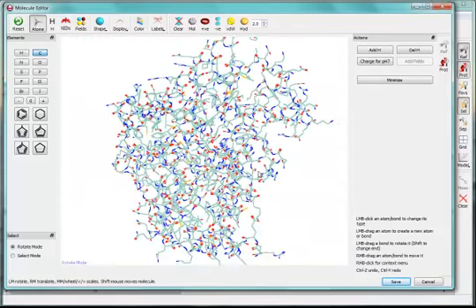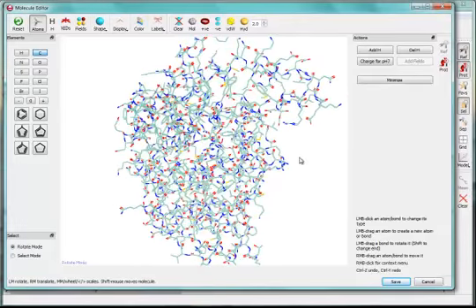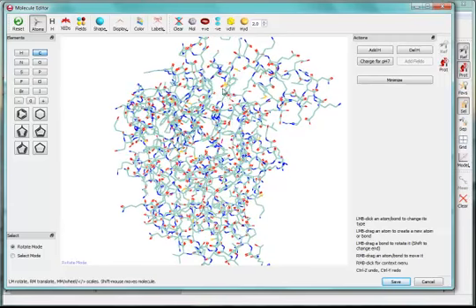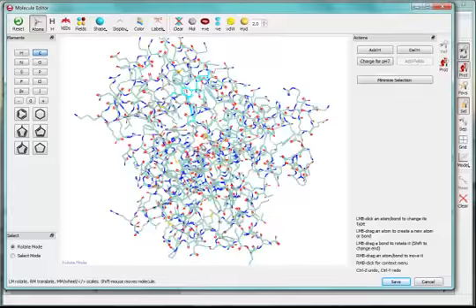If I zoom out a bit, now we can see the ligand of the protein. Next job is to find the ligand. Okay, so what I do is I select the ligand. You can see the ligand's just here. I can see the sulfonamide very clearly there. So I'm going to just right-click on that sulfonamide, select the fragment, and I have the ligand selected. I'll just rotate that around so you can see that.